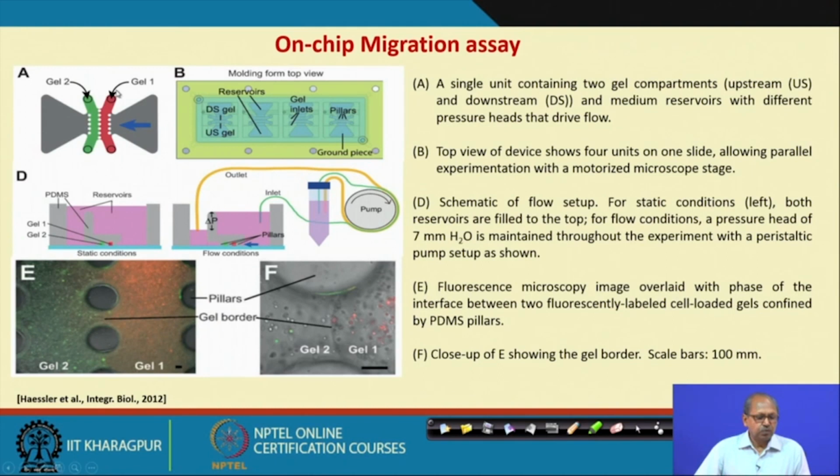That two-gel process was undertaken by the Hessler group. The principle is that when you give the interstitial flow, it will be controlled by the gel concentration of one channel, and in another channel the cells will be embedded and will migrate. With fine-tuning of the interstitial fluid flow, the cells will accordingly sense that fluid flow and migrate.